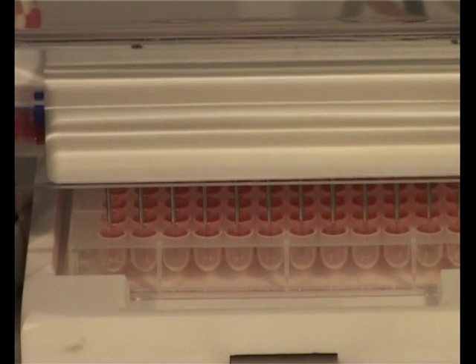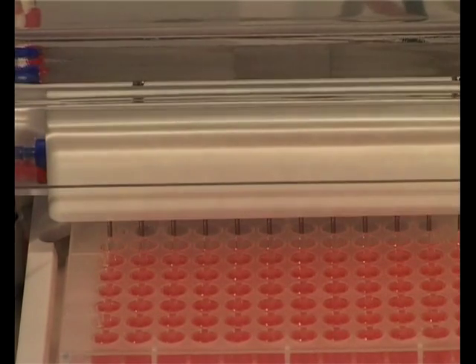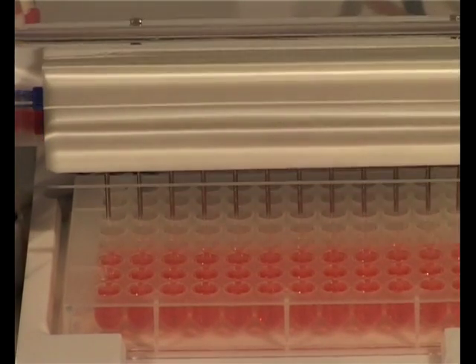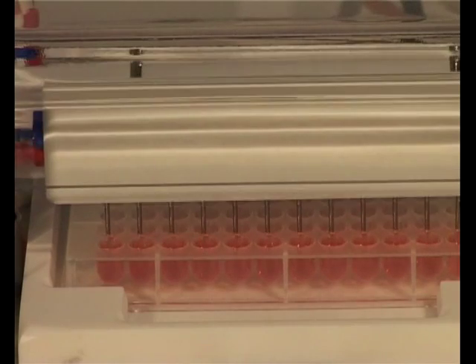The procedure can include several washing stages with different liquids if the 4 channel version of the washer is used. Users have full control over washer parameters to ensure performance is optimised for their particular assay.